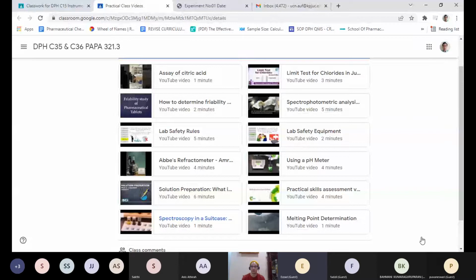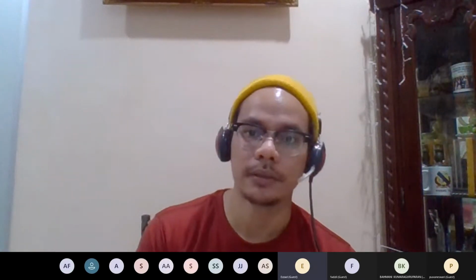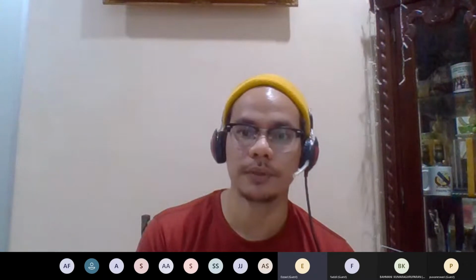Okay, so that was a short video about using the UV-vis spectrophotometer. So what is exactly UV-vis spectrophotometer?